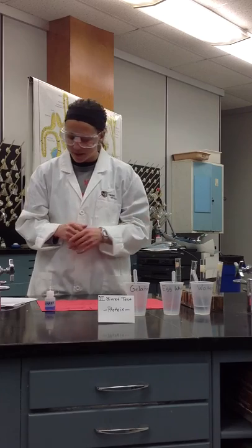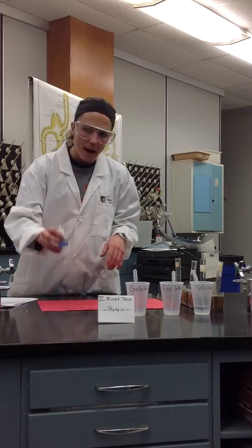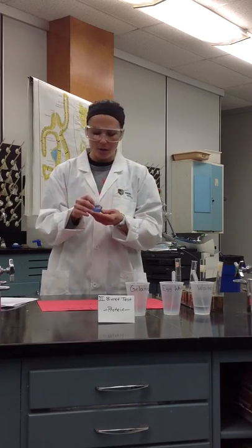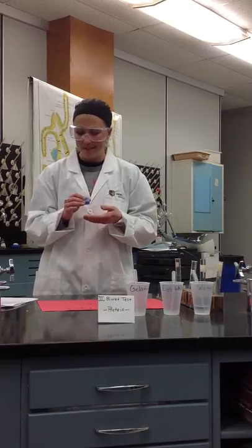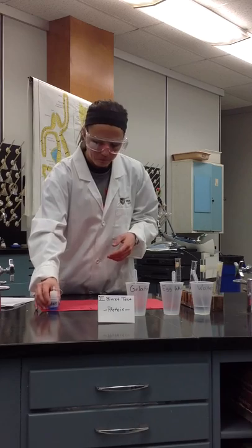Then to each of these test tubes, you're going to add 5 drops of biuret. Now, you need to be extremely careful with this because it's a very dangerous solution that we have here. So you don't want to leave this lid open, and you certainly don't want to be messing around with this.